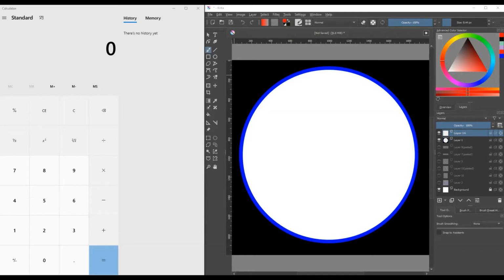So this video is going to show you guys how to measure a cell in a microscope. The circle on the right is your field of view. It's what you'd be seeing if you were looking through the microscope.